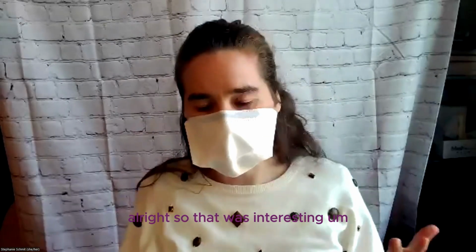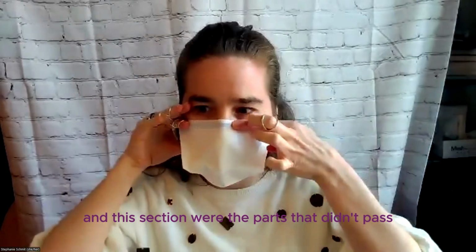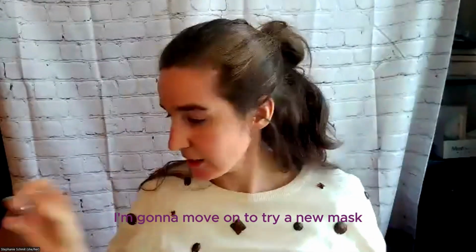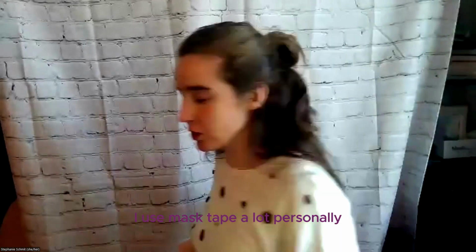All right, so that was interesting. It seems like this section and this section were the parts that didn't pass very well. So I'm going to move on to try a new mask. Oh yeah, mask tape can definitely help. I use mask tape a lot personally.